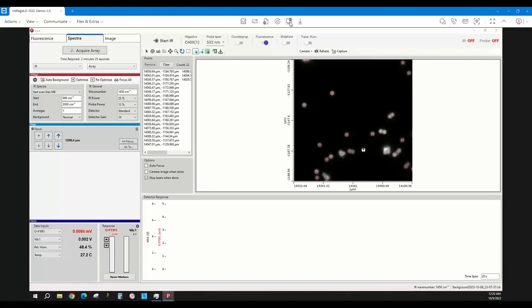Only the polymeric materials would stand out in the fluorescent image. All of the other rubbish, the sand, mussel shells, bones, or cellulose from trees, would not be visible in the fluorescence. So it's a great way to optically, fluorescently filter your samples and then collect spectra only from the plastic. So I'm quite enthusiastic about that.